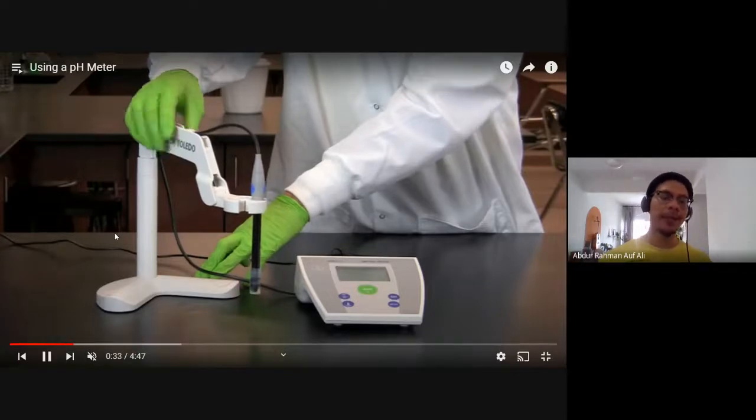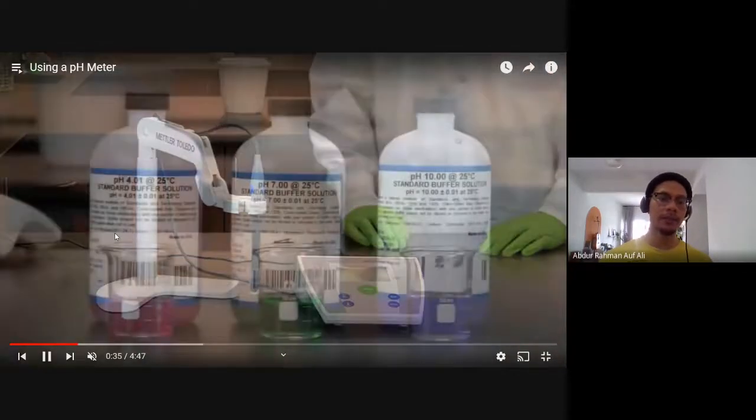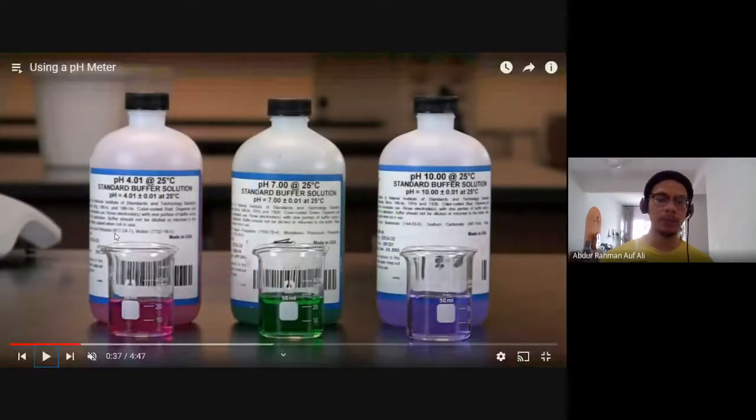Before we perform any testing using the pH meter, we need to calibrate it first. We need to make sure its readings are correct. So we use buffer solutions. So these are the three buffer solutions. The first one is pH 4, acidic. Next one in the middle is pH 7, neutral. And the other one is pH 10. Okay, a basic solution. So before we test our salbutamol solution, we need to test first. We need to dip the electrode in each of these pH solutions.